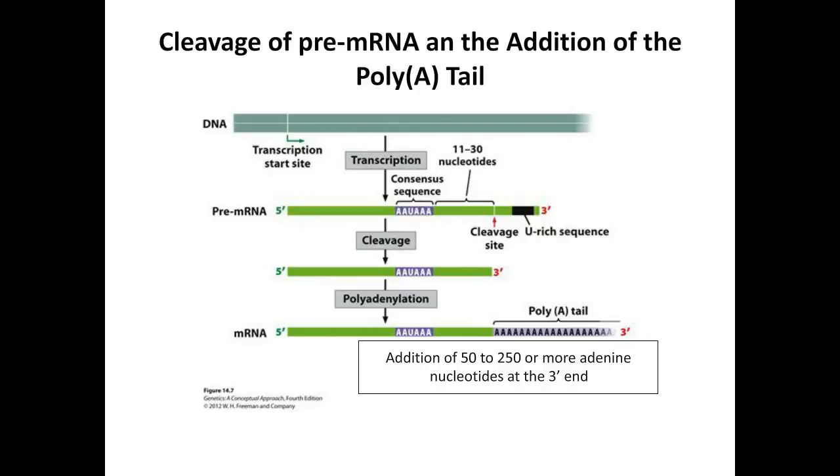So we first have premature and then mature RNA, and there is quite an amount of variation in terms of where the transcript will be cleaved. It could be at different sites, and this alternative cleavage produces variation in the transcript length at the 3' UTR region. Some transcripts from the same gene could have a longer UTR region, and others a shorter 3' UTR region.